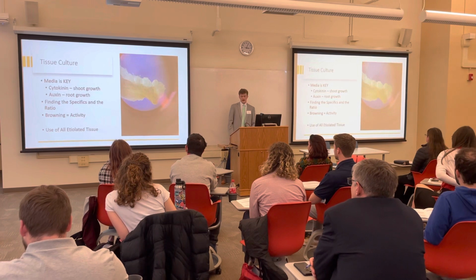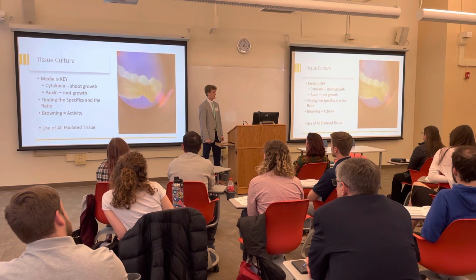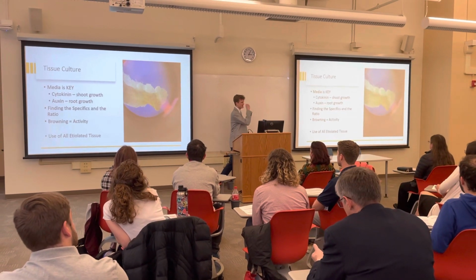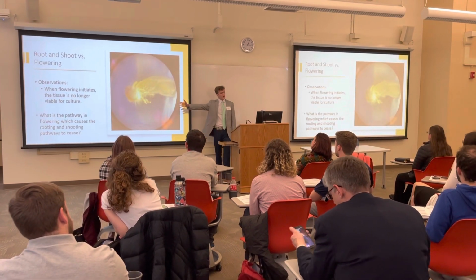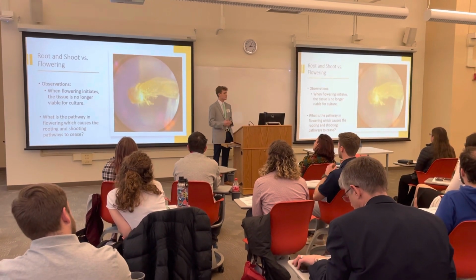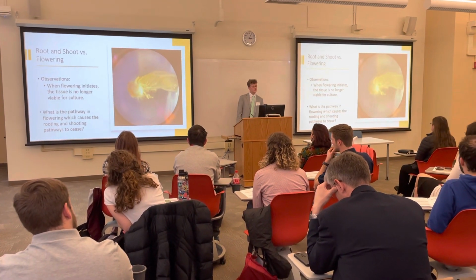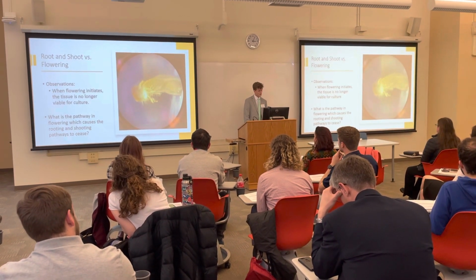And we are using etiolated tissue because, quite frankly, we ran out of options. When it comes to non-etiolated tissue, it doesn't work for us. And so we grow this tissue in the dark, hoping that there is some kind of light switch or some kind of cold-tolerant switch that is working with us. When flowering initiates, the tissue is no longer viable for culture. This indicates that we have to use a specific age range, usually 1 to 2 years, but we don't know that for sure. This is just an observation we made, so that's another thing that I am confirming. And we want to figure out what that pathway is for flowering that causes the rooting and shooting pathways to cease. It could be a genetic moment, we don't know.